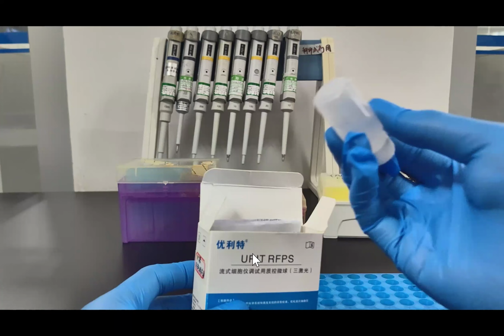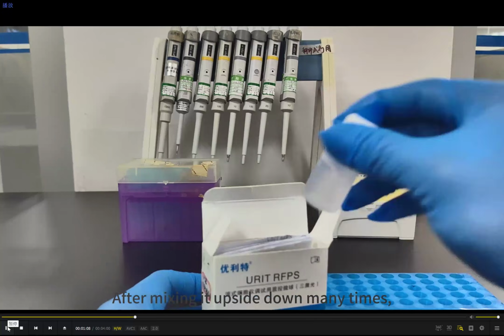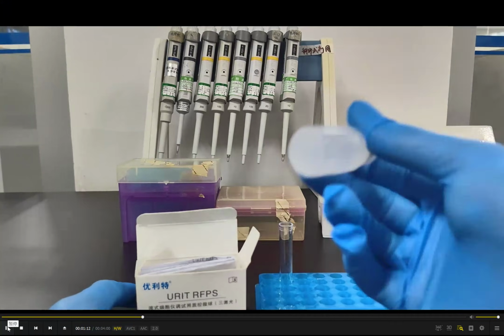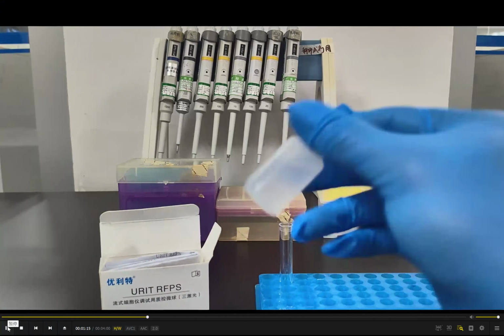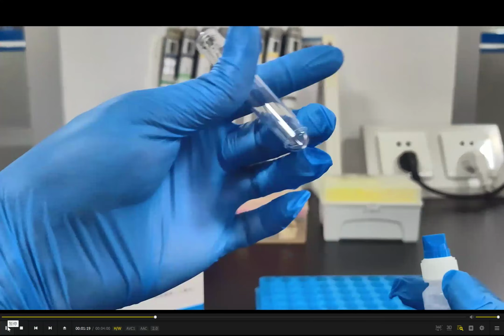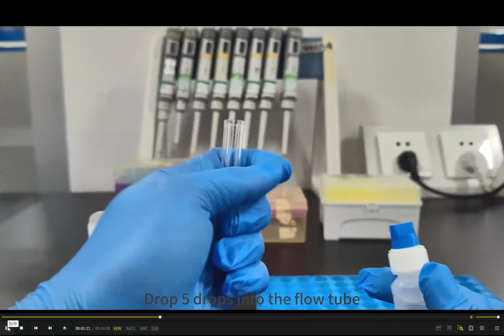This RFPS, these QC reagents need to be placed in the refrigerator. So if you leave the QC at room temperature, it may not work anymore. After mixing it upside down many times, drop 5 drops into the flow tube.